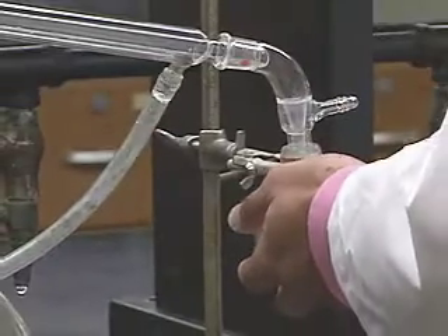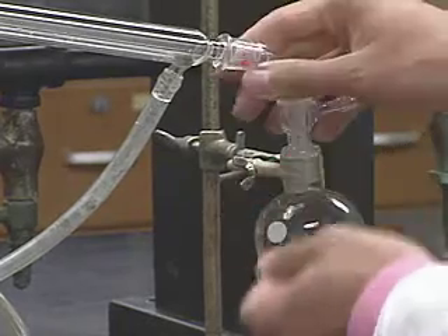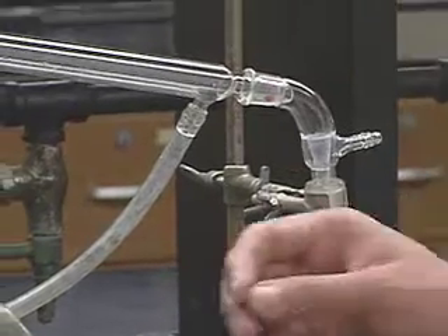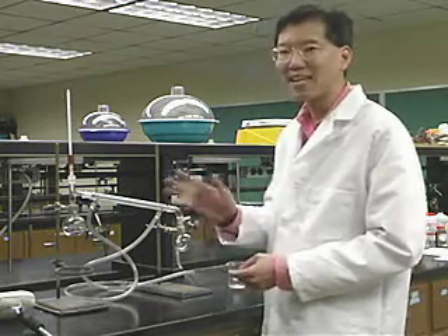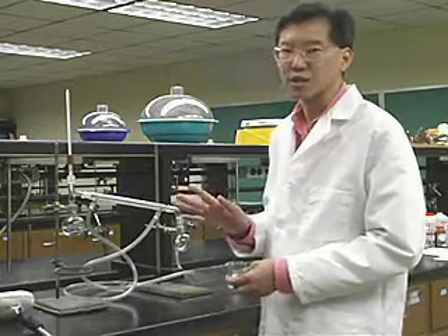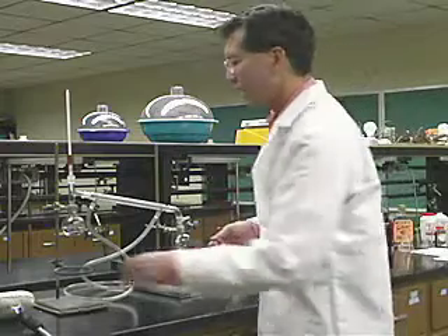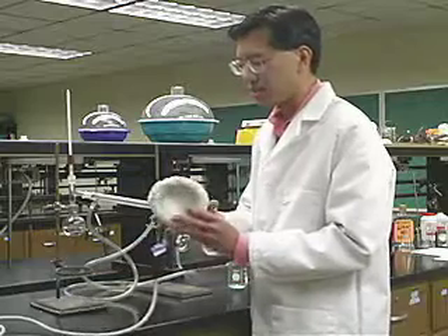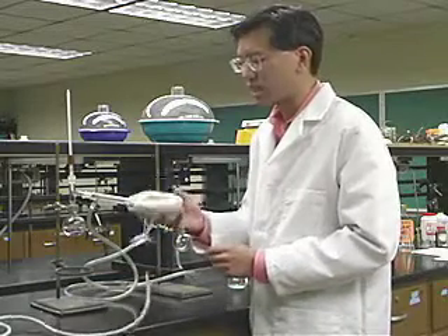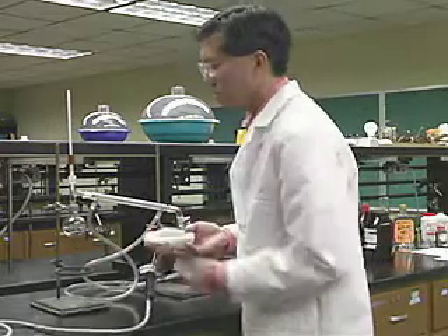I'm going to connect the bottom end of the condenser to the cold water source through a piece of plastic tubing. Now when you do distillations in the laboratory — in fact, when you heat almost anything in the laboratory — it's a good idea not to use a Bunsen burner. Bunsen burners are fine for flame tests, but in general an open flame is dangerous because you can ignite the vapor. So what we're going to use is something called a heating mantle. Basically it's a resistively heated coil, and it's a much safer way to heat our still pot.